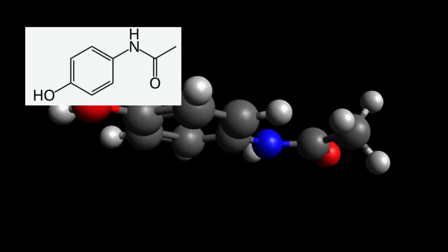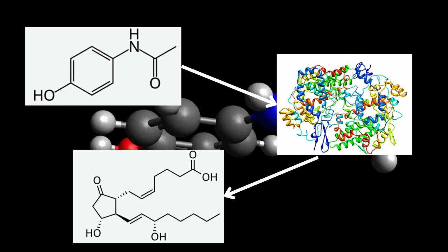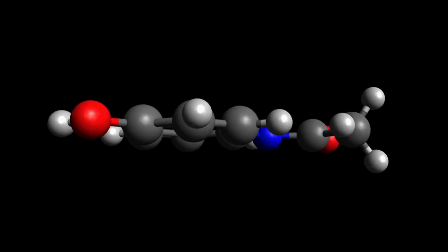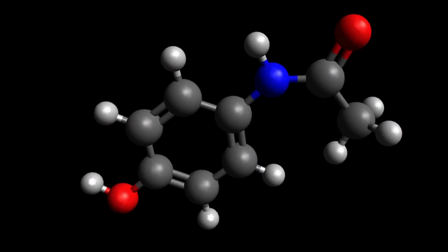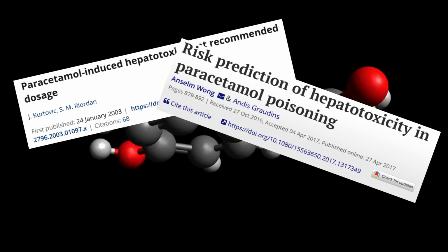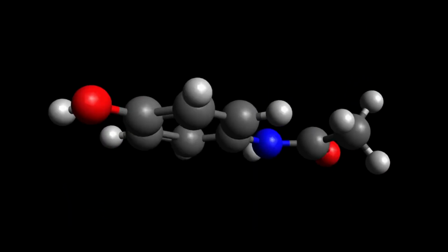Paracetamol, as a non-steroidal anti-inflammatory drug, is an inhibitor of cyclooxygenases, and thus diminishes the production of prostaglandins. Despite often being cheap and very effective for treating fever, pain, or inflammation, paracetamol has a significant hepatotoxicity. In this video, I'm going to extract paracetamol right from tablets.